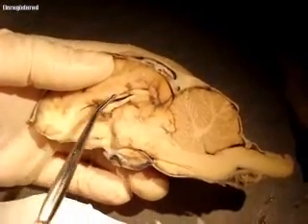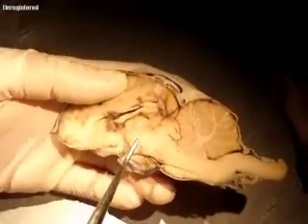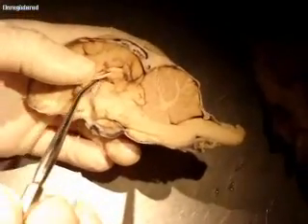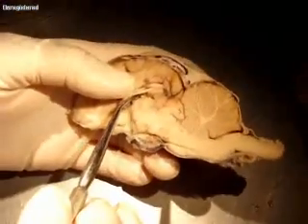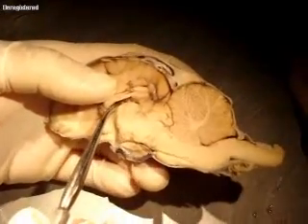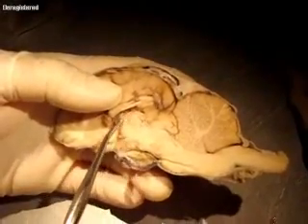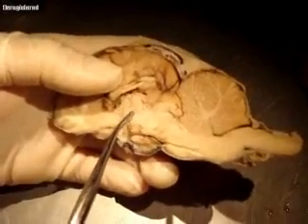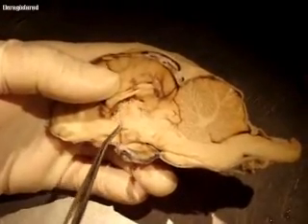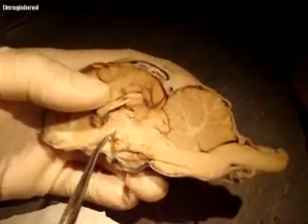And by the way, lateral ventricles are the ventricles 1 and 2, but they don't number them, they just call them lateral. So this comes all the way around, and you can see underneath the fornix there's even more of this choroid plexus, and there's a little opening. So this little opening underneath the fornix, plus this area right here, which is the thalamus, the center raised area is called the intermediate mass, or the massa intermedia of the thalamus. This is all third ventricle. All of this is third ventricle.